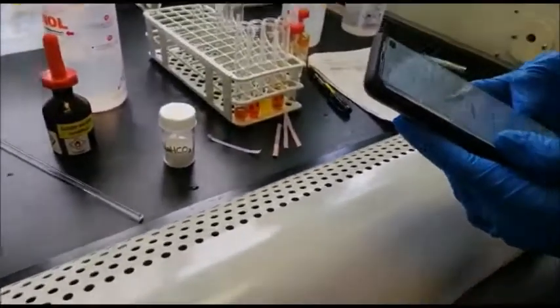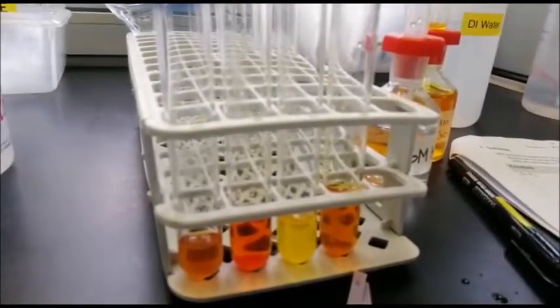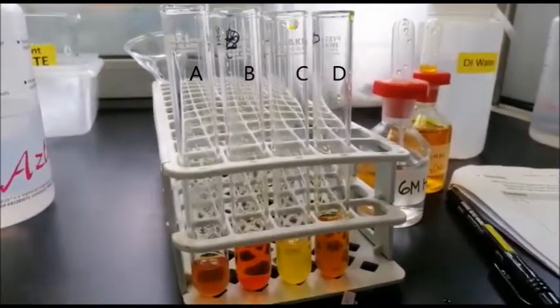From our tests, we concluded that drug A was paracetamol, B was ambroxol, C was aspirin, and D was loperamide. This concludes our chemistry video.